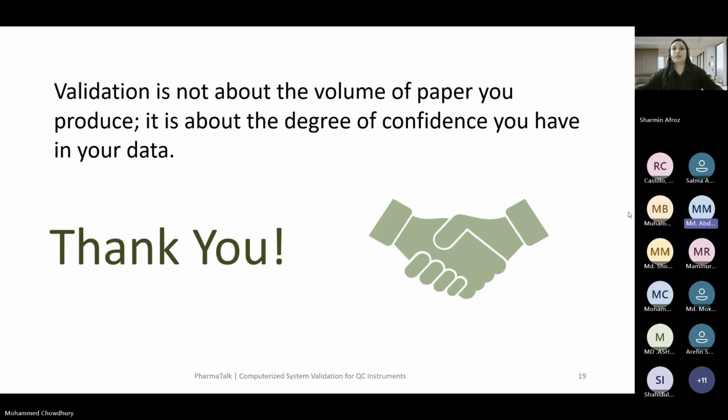And for other systems, like the moisture content measurement system, the colorimeter, we perform the PQ by preparing the protocol ourselves. I want to know what is the best practice. Should we follow the supplier protocol, or prepare a PQ protocol for ourselves, then perform the test?